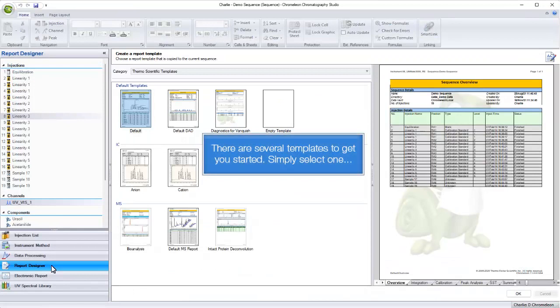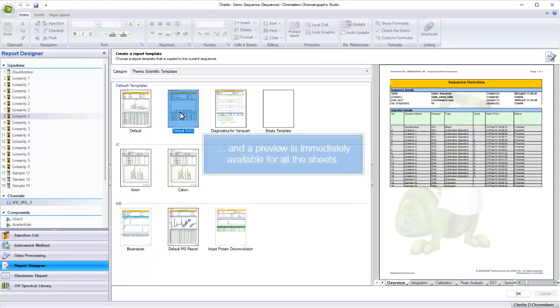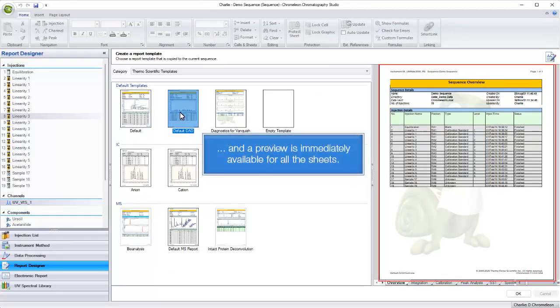There are several templates to get you started. Simply select one, and a preview is immediately available for all the sheets.